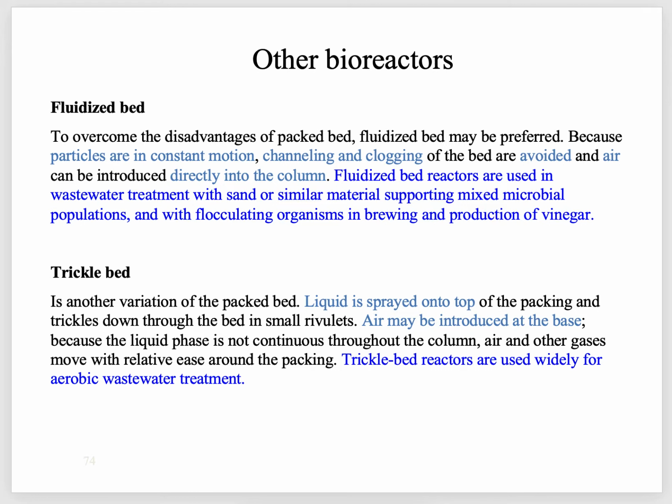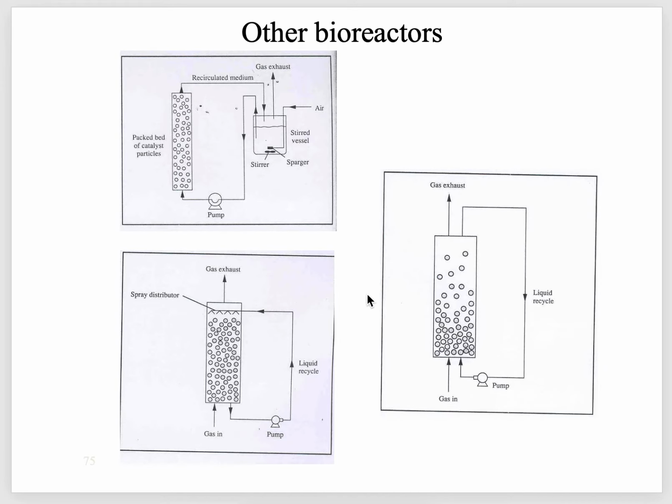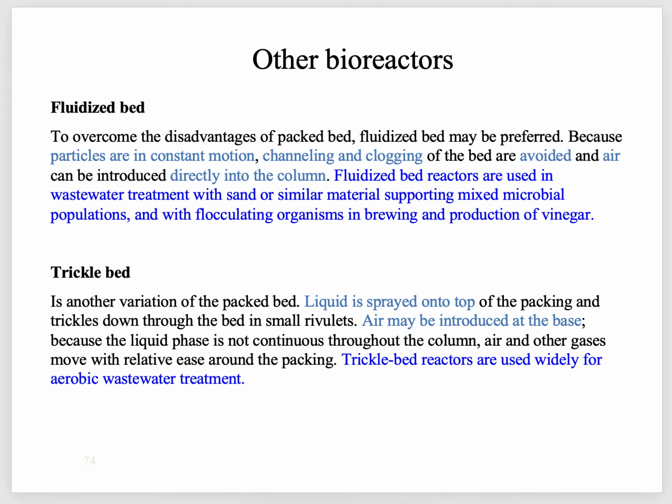If you look at this figure, this right side one is a cartoon figure of a fluidized bed bioreactor. Like in the fluidized bed bioreactors, the catalyst can move. They can continuously move. So you can directly introduce the air into here. So this was fluidized bed.